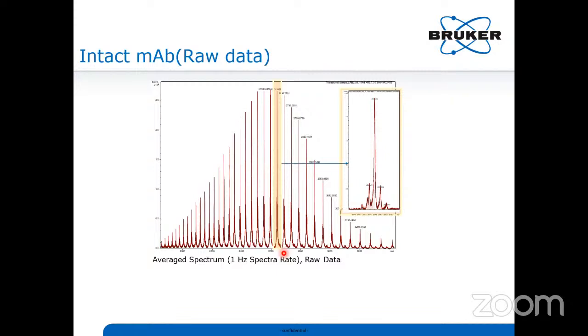For example, here I am saying 2800. By charge state, it may be around 24 plus or 34 plus. If your molecule mass is 100 Dalton and it's a 4 plus charge state, in this raw spectra you are not going to get 100 m/z, you will get 25 m/z. 25 m/z with 4 plus charge state, that means 25 into 4. My mass is 100 Dalton. I got it as a 4 plus charge state in the mass range of 25.